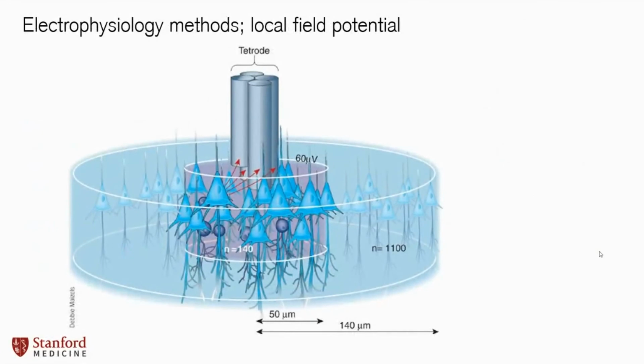So if you are doing electrophysiology, and I've done a bunch of it, I would really recommend looking at local field potentials. So that's different in that you're just sticking electrodes in this bulk mass of many, many cells. Here you can see a tetrode from a Buzsaki paper from 2004. And you're not actually puncturing any cells. You're sort of measuring the net field of a local area, shown in pink here, relative to some ground electrode that's sort of off-site here.